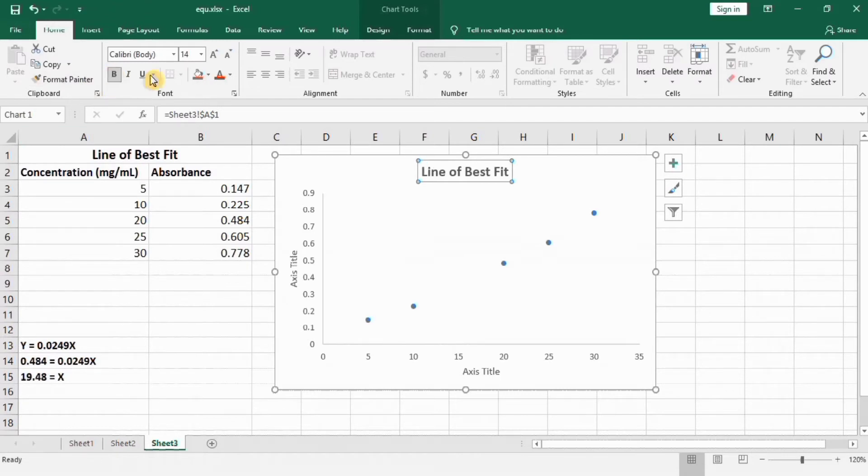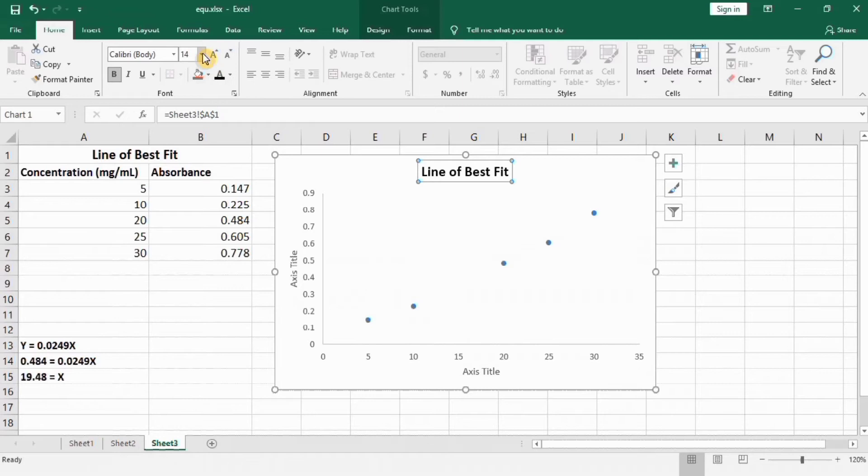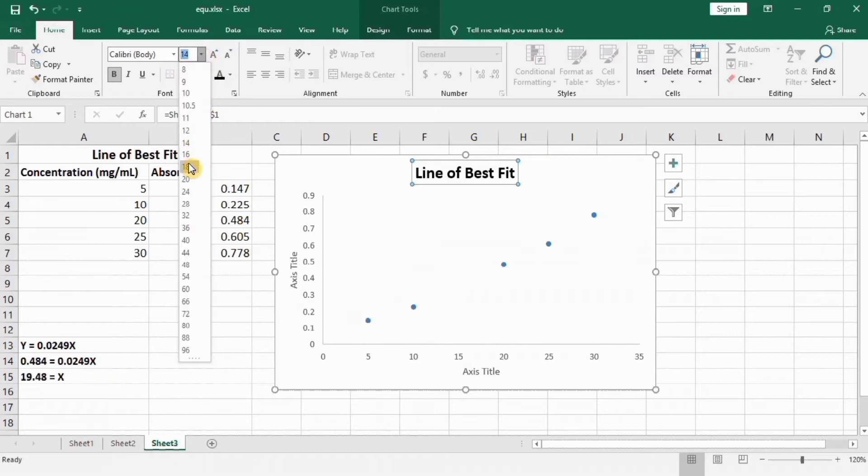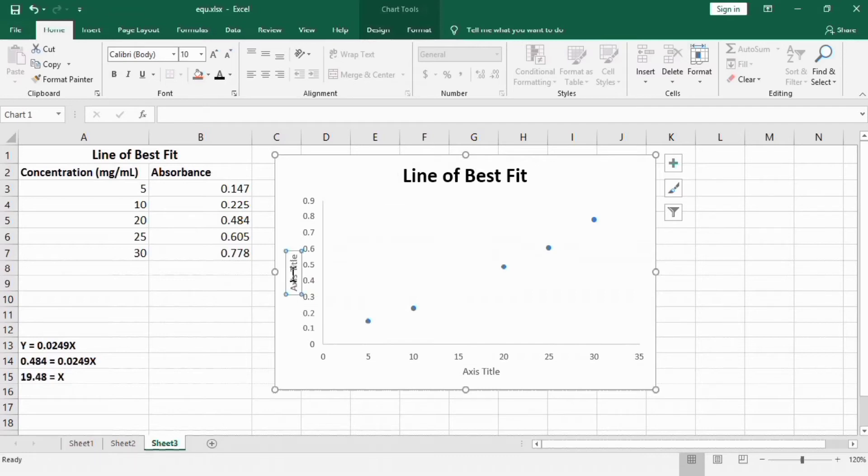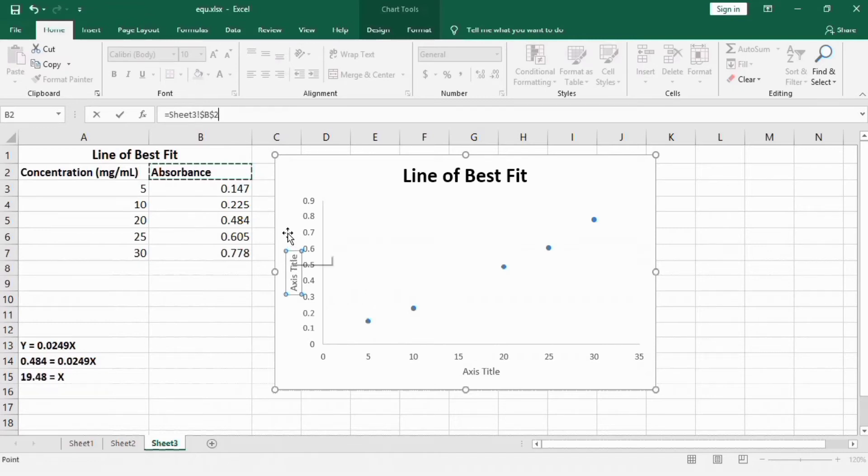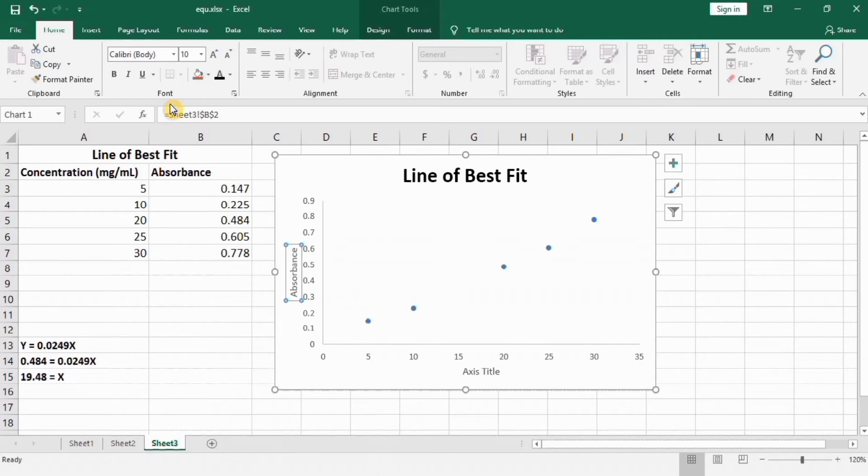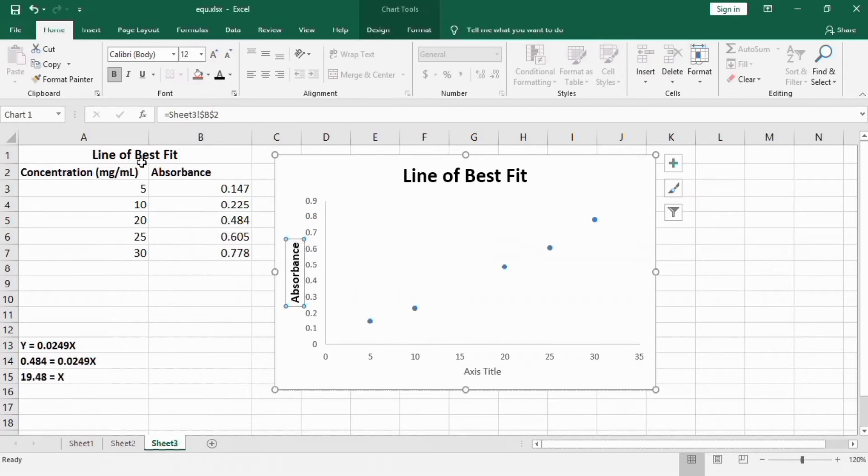You can format it using this option. Similarly if you want to edit axis title, select this one and you can edit. I will use short term for that purpose. For example I will put equal sign and select this Absorbance cell because it shows the absorbance. Click enter, and make it bold, black, and size 12. I am using this cell because when I edit this one, this will automatically edit.